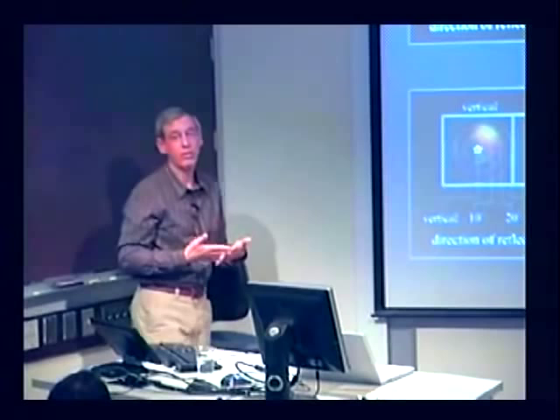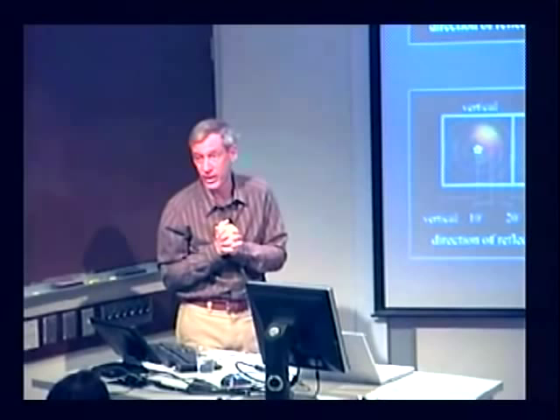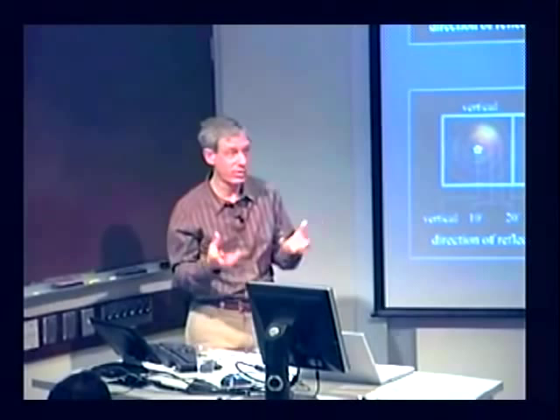So we might be able to measure something like this in the microscope and combine this BSSRDF ability with the crude range finding that I showed you before, and you can imagine that we might be able to build models for the appearance of objects at a microscopic level that would have a wide variety of applications that people have not really been able to build so far, because they don't look at both the positional and the angular aspects of what they see through the microscope. So with that, I thank you for your attention, and I would be happy to answer any questions.